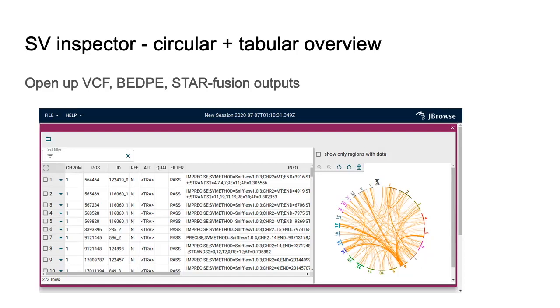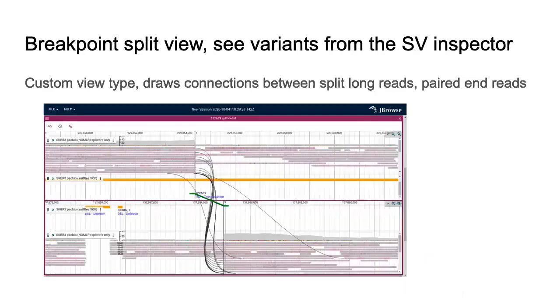And a really cool thing is you can click on any of these little things in the circle. This is a cancer genome sample, so it's very chaotic, but you can inspect any one of these and see the read evidence for one of those events. And so this is the actual data that was used to call those structural variants, and it shows you an interchromosomal translocation, you might call it, where these two chromosomes basically got fused.